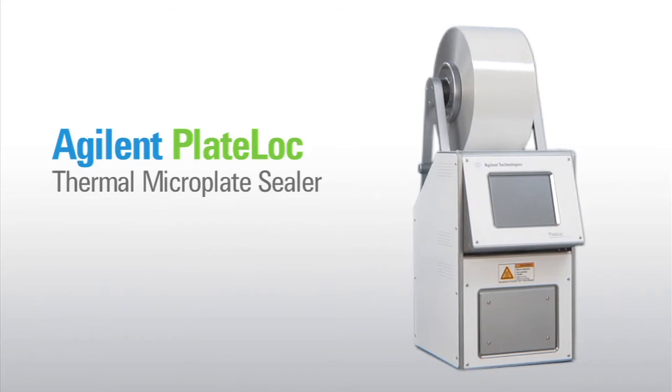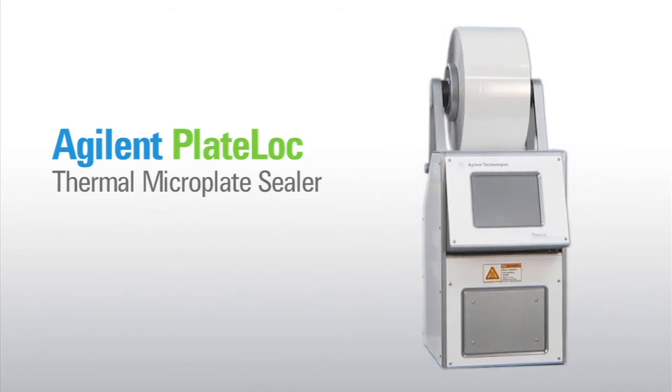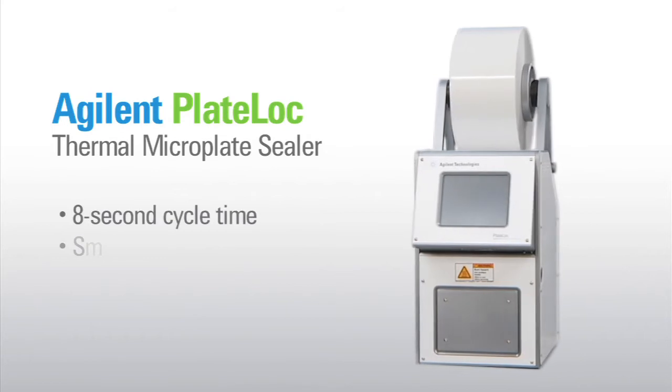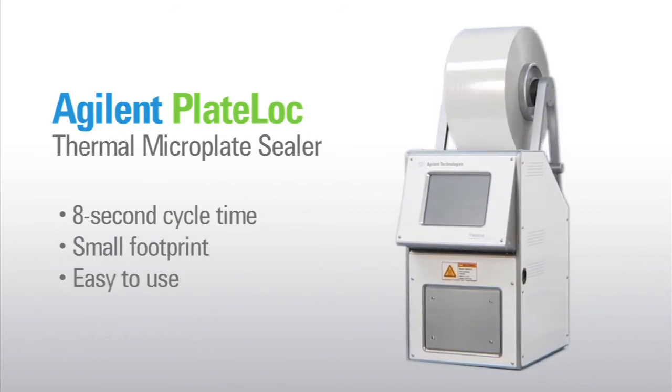The Agilent PlateLock Thermal Microplate Sealer has distinguished itself as the premier thermal microplate sealer through its speed, small footprint, ease of use, and dependability.